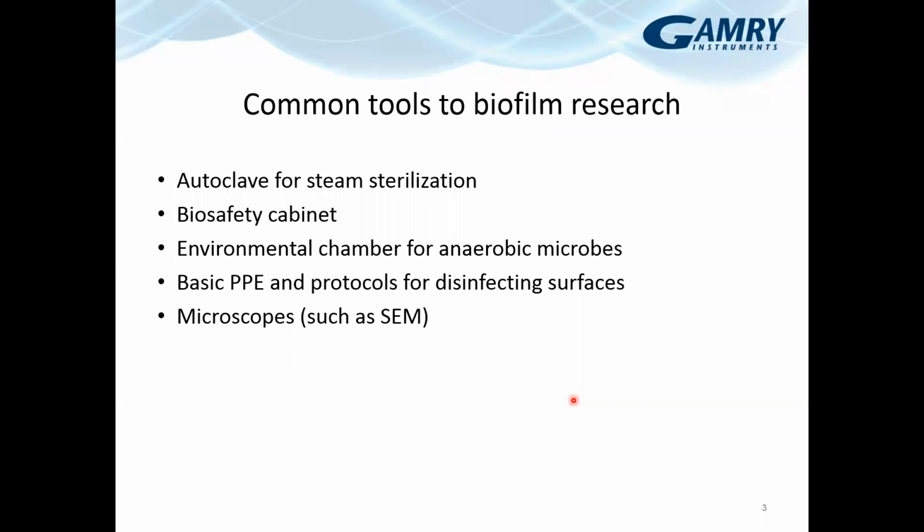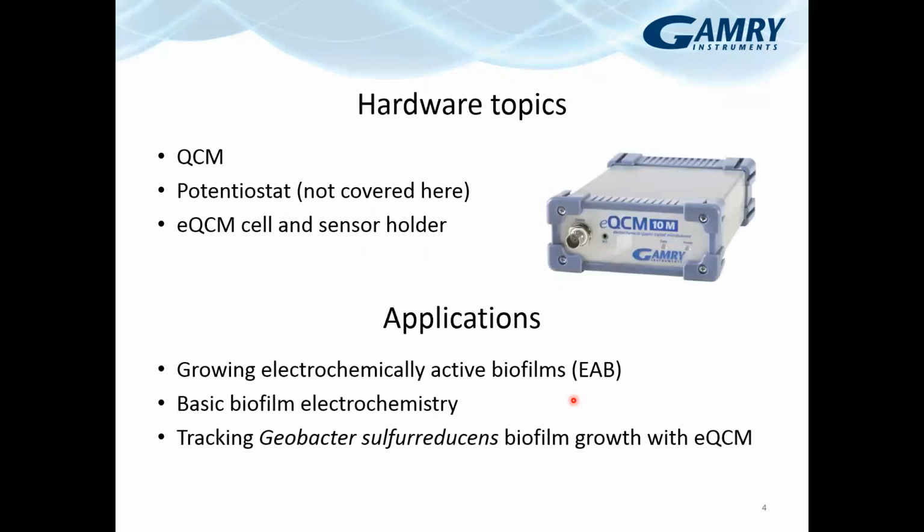So I put this list out there just to remind everybody that this is what I have in mind when I'm thinking about biofilm research tools. Now, you want to integrate the QCM and a potentiostat, and you need some kind of EQCM cell and a sensor holder, and it has to integrate nicely with what you have as biofilm research tools. And so that's what I'm going to cover today, and that's at the top here.